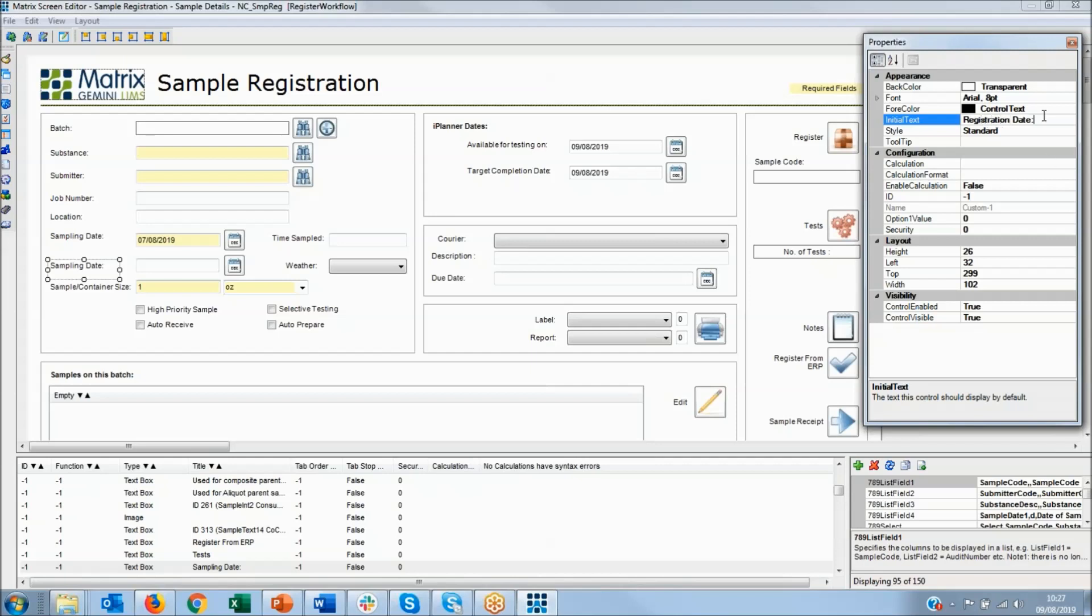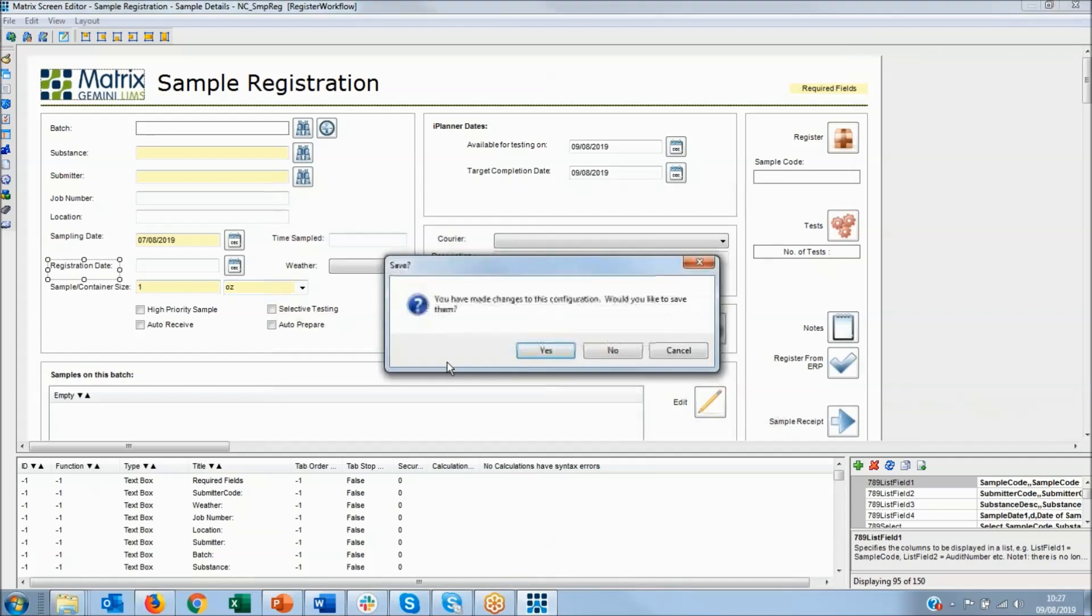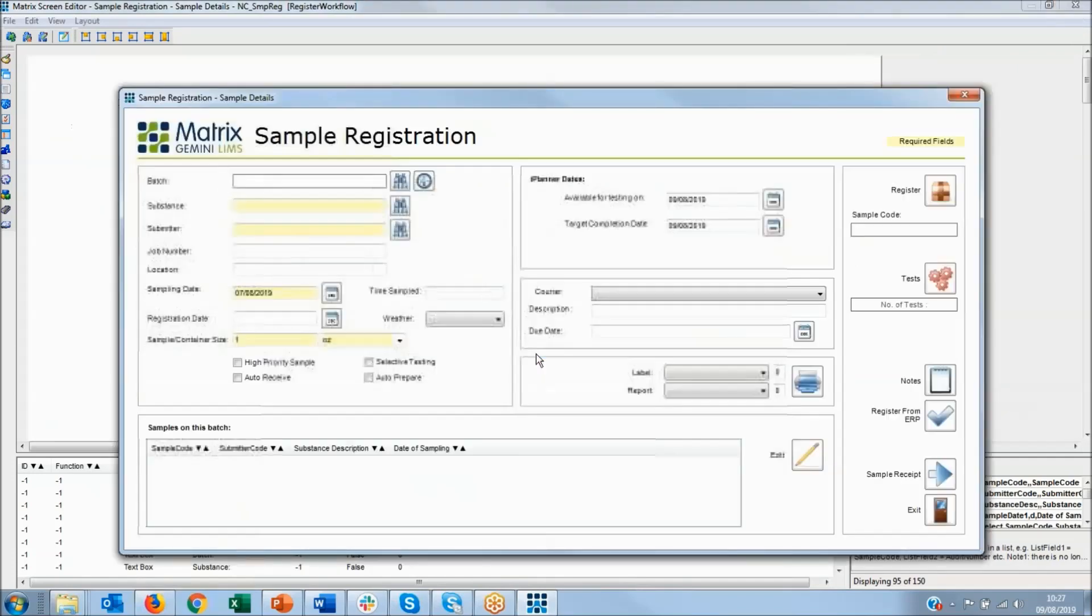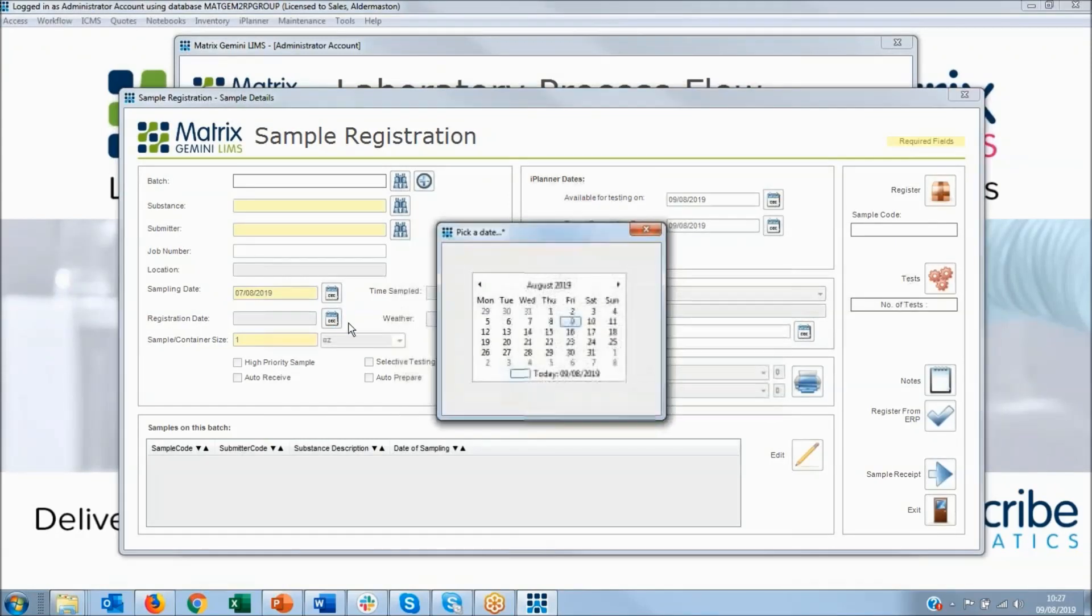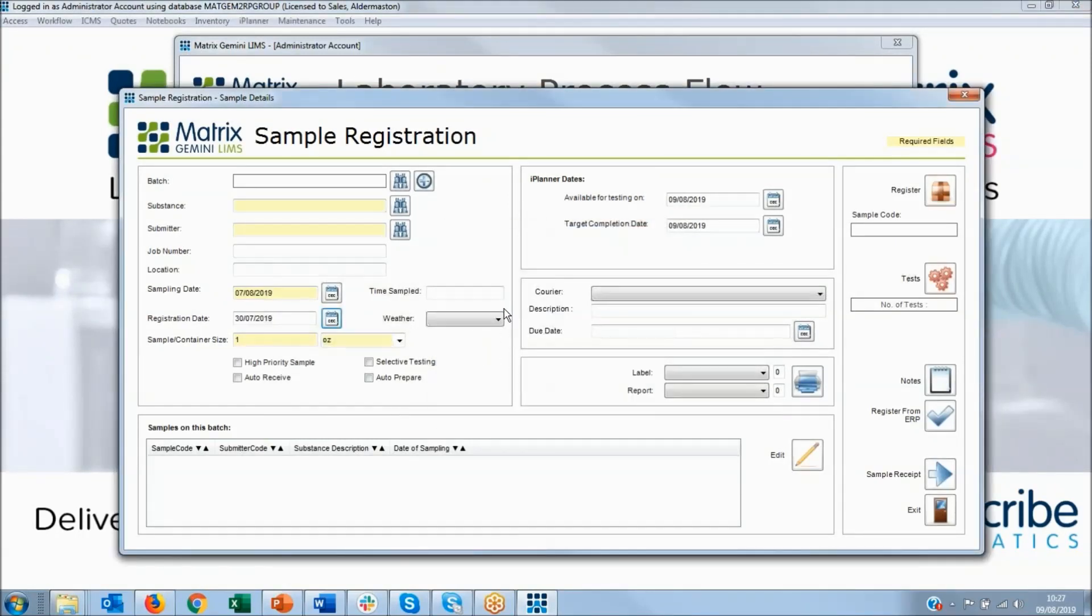There we go. For instance, so if I wanted to put a registration date in here, I'll just pick a date and it goes in.